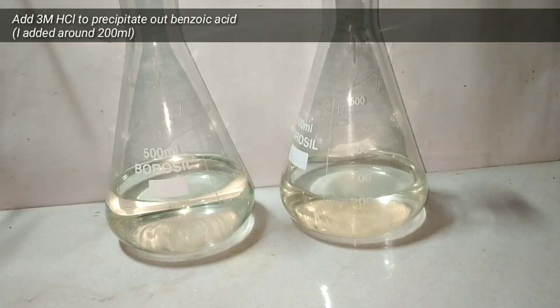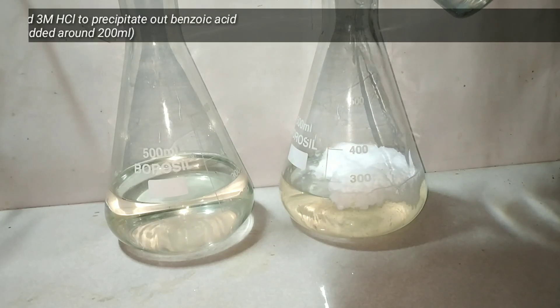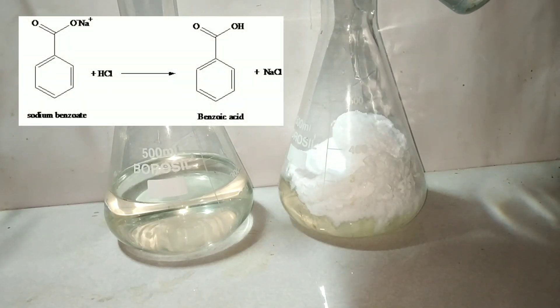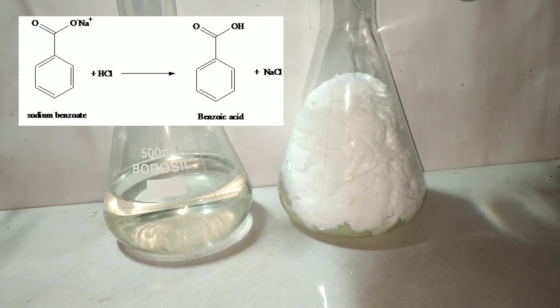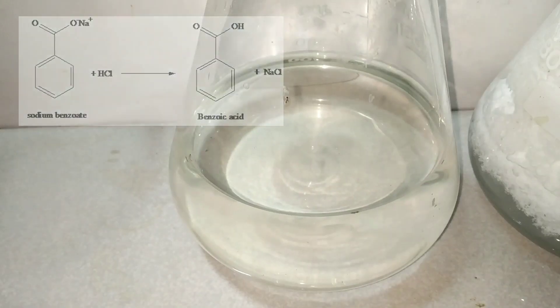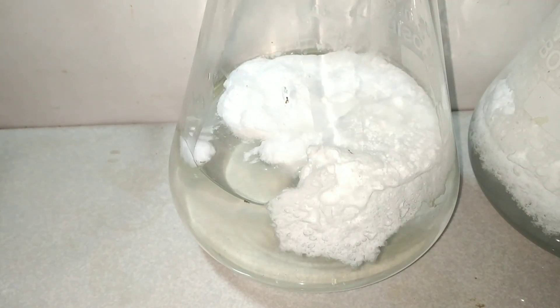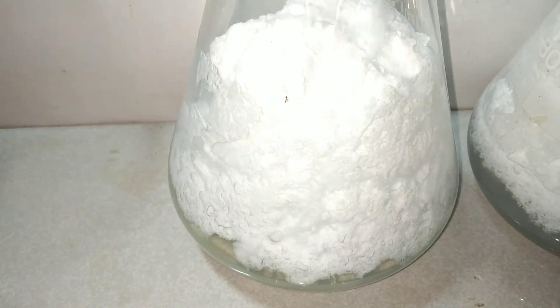Next we need to precipitate out the benzoic acid. For that I am adding 3 molar hydrochloric acid — I have taken about 200 ml of it. On adding the acid you can see a white creamy precipitate being formed. This is the crude benzoic acid separating out, as it is insoluble in cold water or sparingly soluble at room temperature.